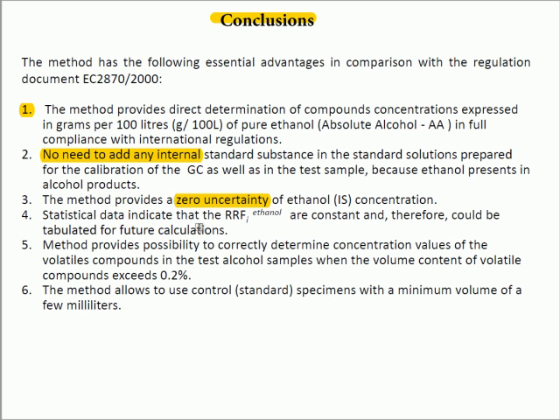An important advantage, of course, is that we can measure the concentration with a large content. The fact is that in accordance with the European regulation, determination of contents of volatile compounds is performed by alcoholometric tables on the basis of measured values of density. However, alcohol-containing products with a high content of volatile components, such as whiskey and brandies, as I have told earlier, make it impossible to correctly identify their strength with an areometer. The proposed method doesn't require the determination of the density of the sample.